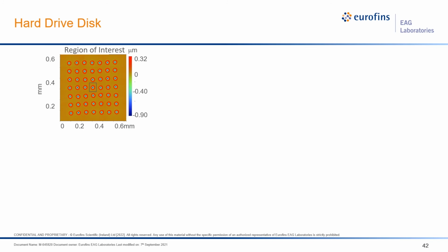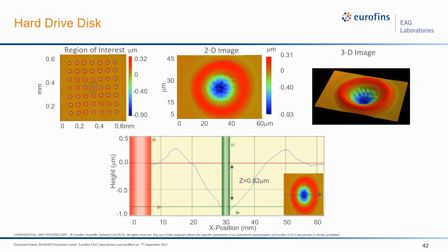Using our highest magnification, it was possible to image a single landing zone structure at a similar size to the AFM data. This OP data provides similar critical dimension measurements and topography details such as the dimpling within the structure. While the resolution of the OP image is much less than AFM, this technique may provide sufficient information for the application. The trade-off is analysis time.